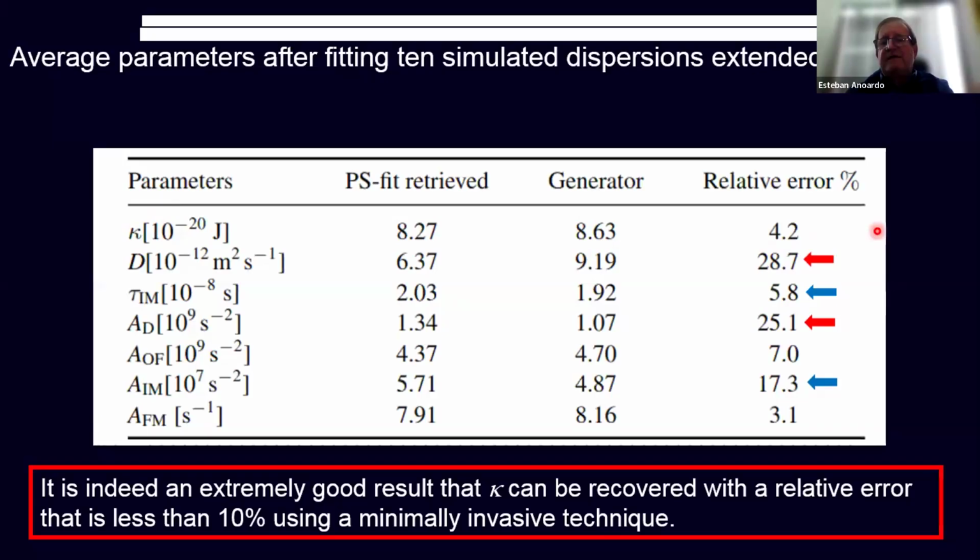You have just the supporting fluid and the liposomes, you do absolutely nothing to them. Magnetic fields are too low to produce any orientation or geometrical deformation on the liposome. So I should say this is a quite non-invasive technique, in contrast to other techniques that are quite invasive.